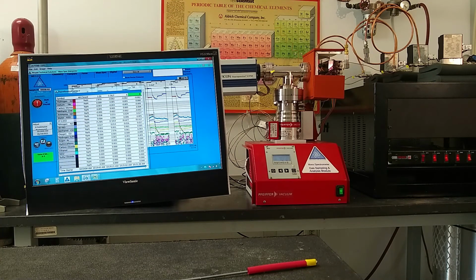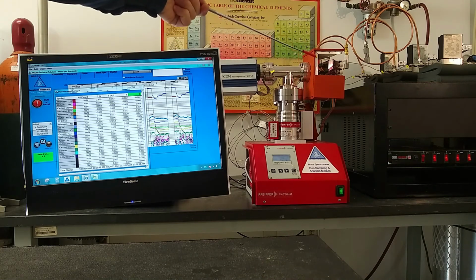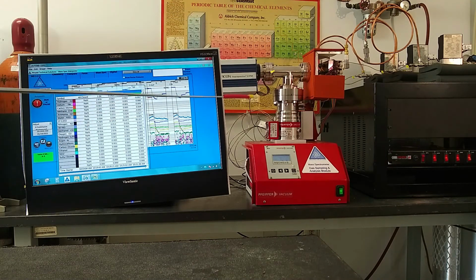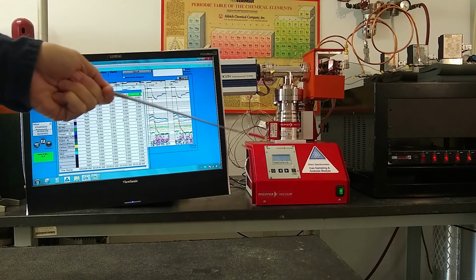So we have 8 capillaries capable of bringing in samples, and we're able to select which of those capillaries we're sampling at a specific time into our sample chamber. So that's our mass spec system, fully integrated here.